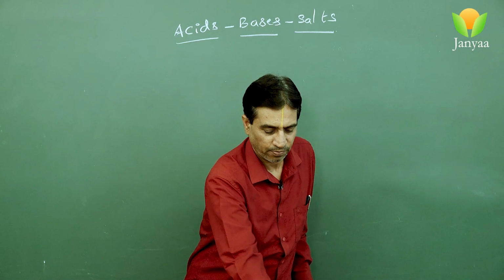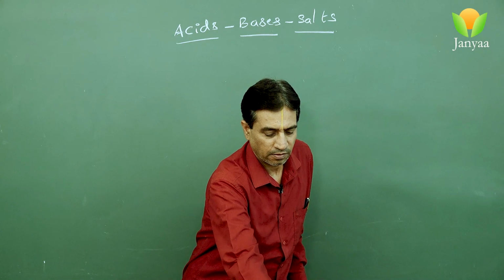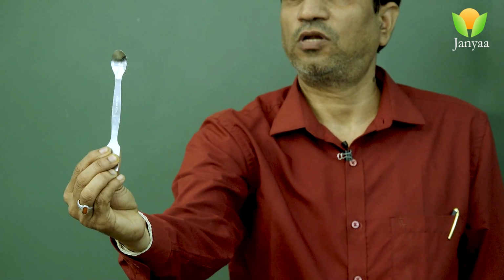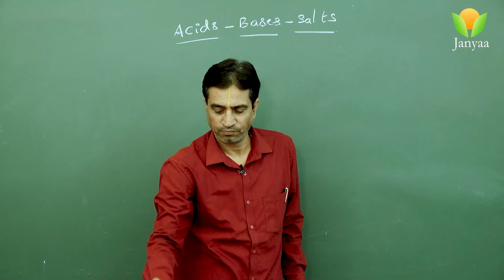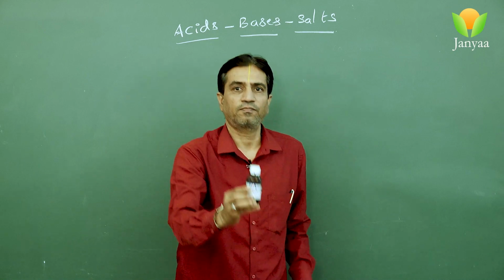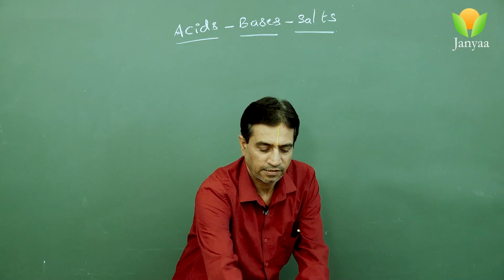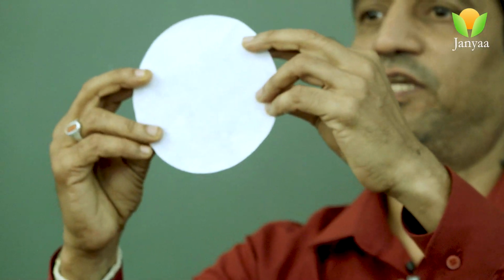Similarly, we are using the spatula. See, this is distilled water and this is a filter paper.